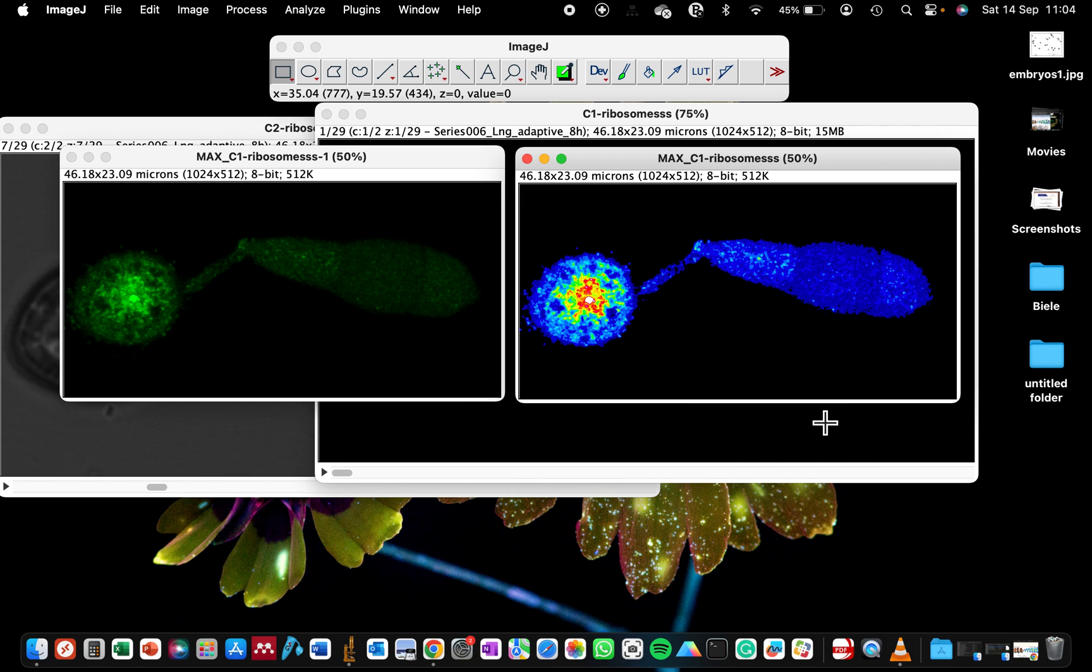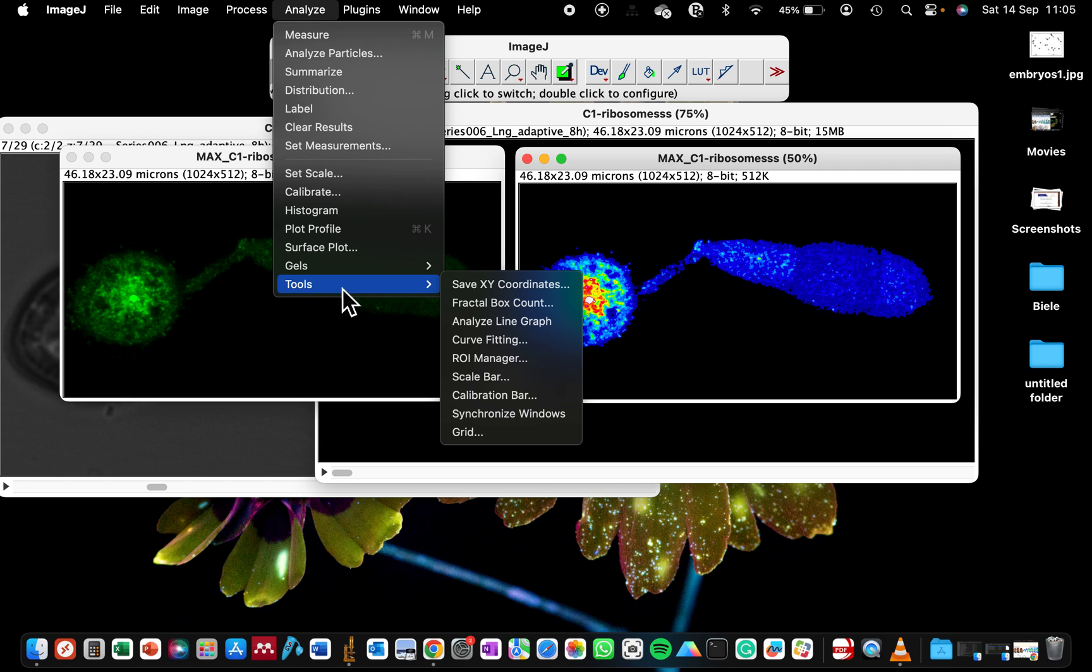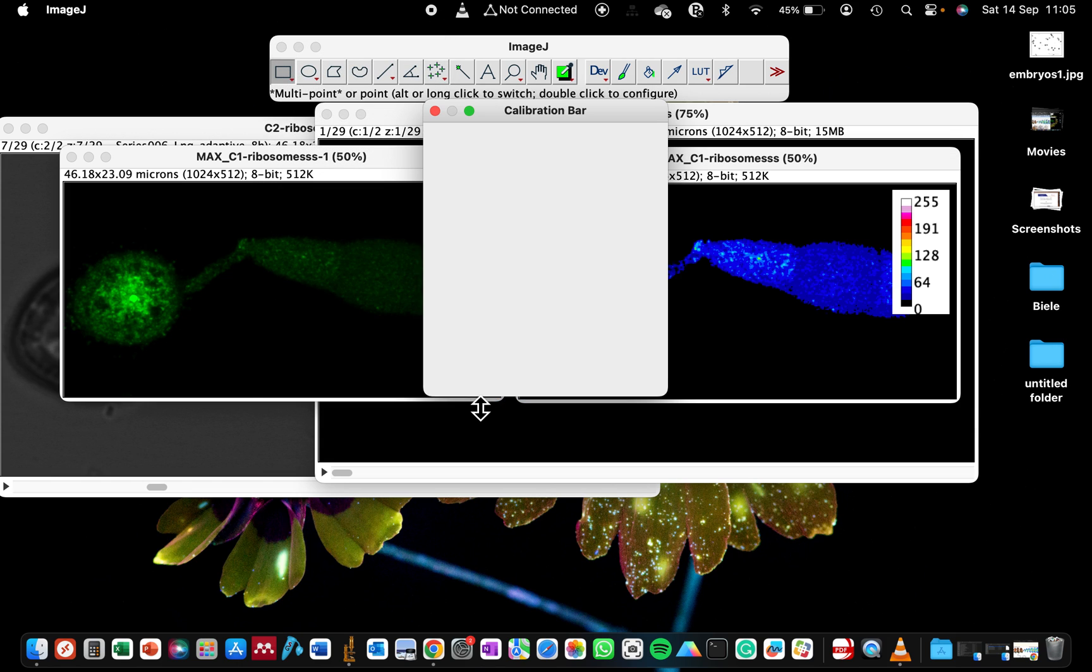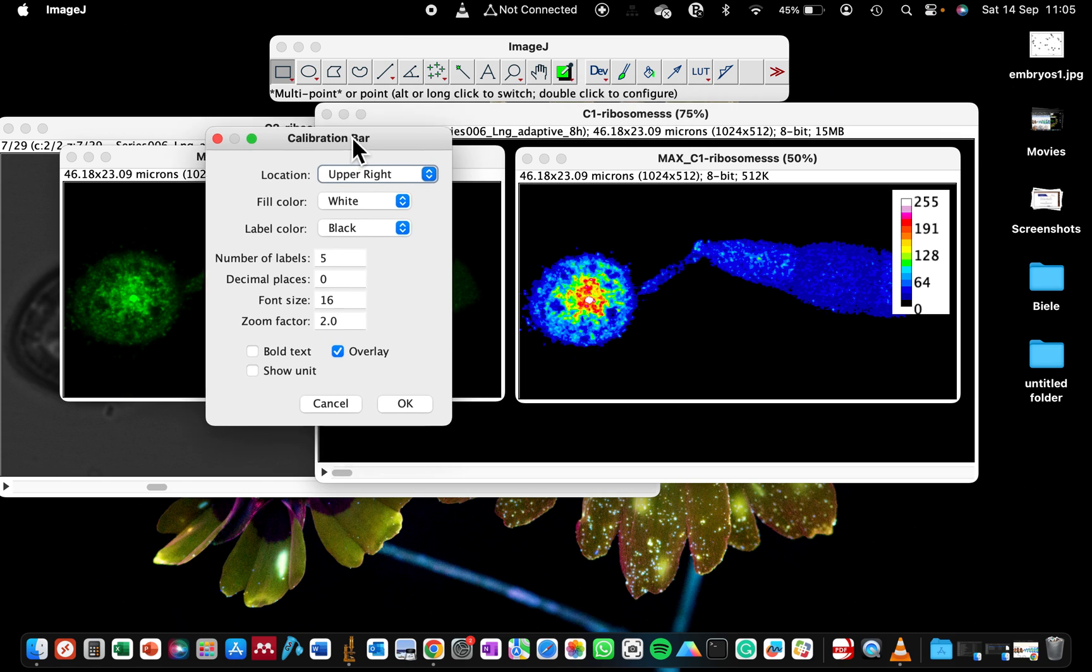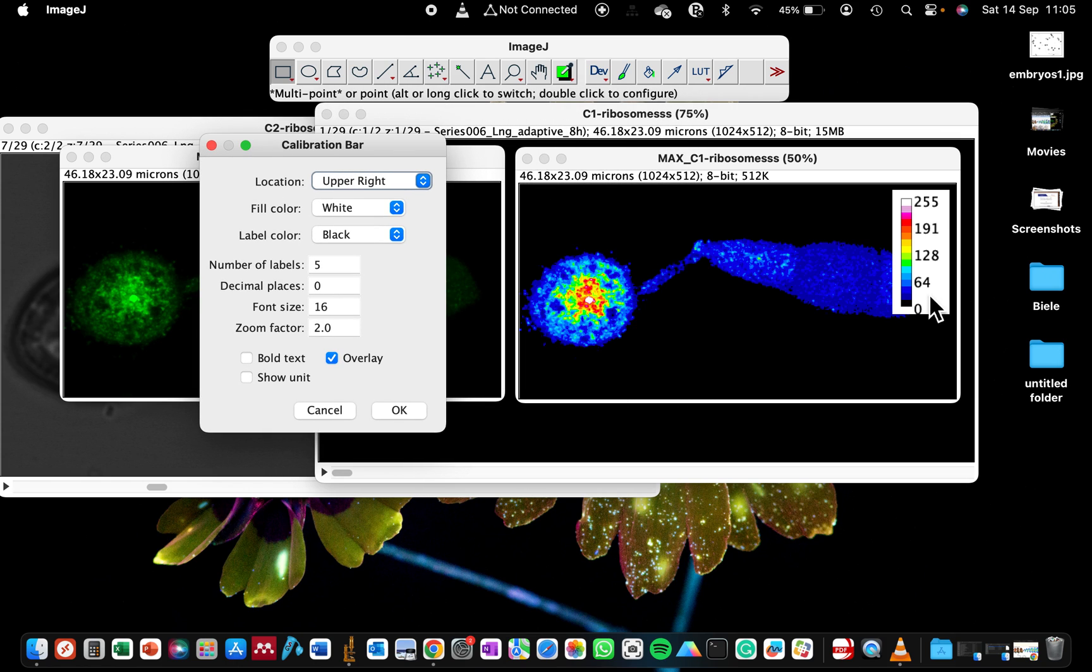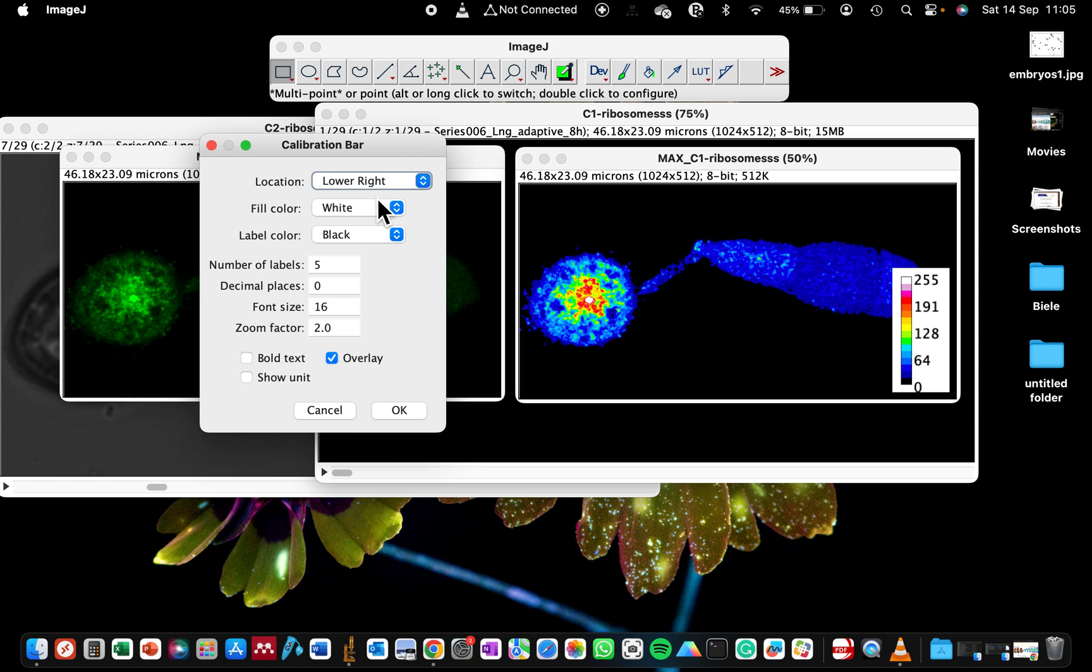We need to calibrate the image to include a scale bar. To do this, go to Analyze, select Tools, and click on Calibration Bar. Now we have a calibration bar here. You can change the location of this calibration bar if it is obstructing your image. You can make it on lower right or any location you want.